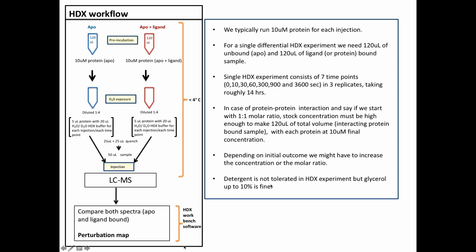Now, we do GPCR work. We are using detergents, but there are certain detergents that are not tolerable. Basically, anything your proteomics core hates, we're going to hate because it's going to interfere with the electrospray process.